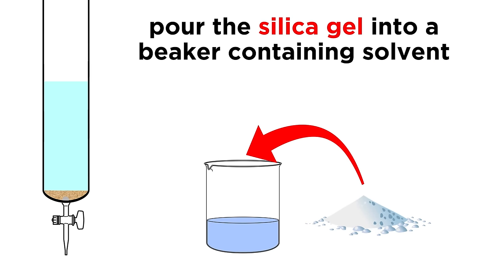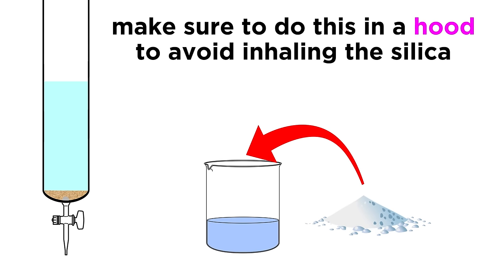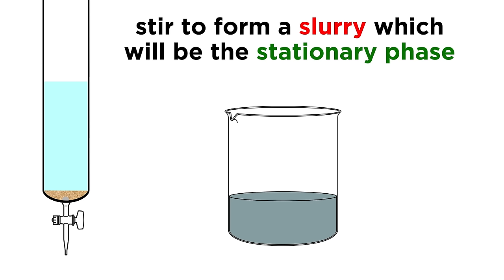Now we take a beaker of our solvent and pour in the dry silica gel, which is a powder, making sure to do this in a hood so as not to inhale the silica. Stir things up until we get a slurry, and this will act as the stationary phase in our column.